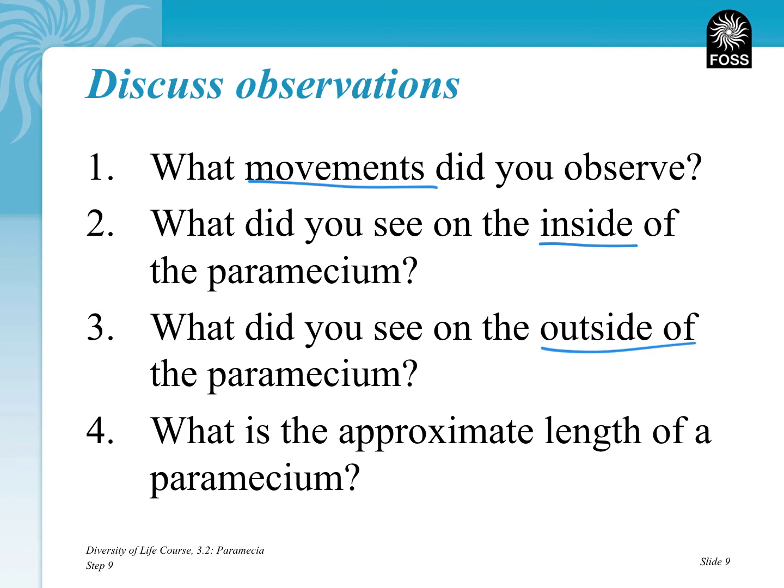And then approximately how big, what was the length of the paramecium? It would almost fit all the way across the 400x. So if that was the case, all the way across would be 0.4, so almost across would be maybe in the neighborhood of 0.3 millimeters for the length. If we got it to hold still, that'd be the hard thing. So yeah, lots of different features about that paramecium that would be different than the Elodea.